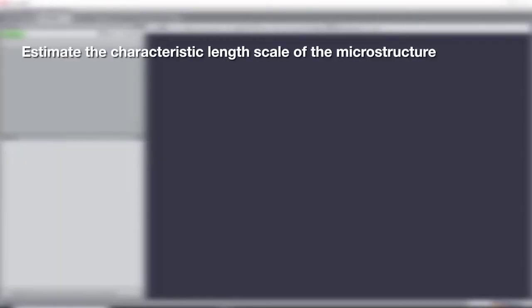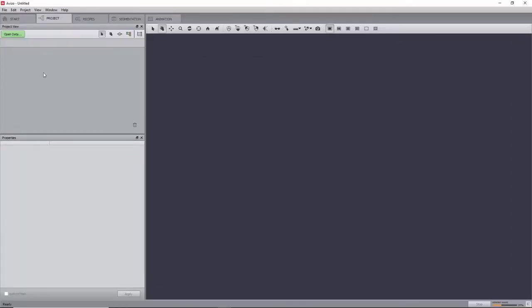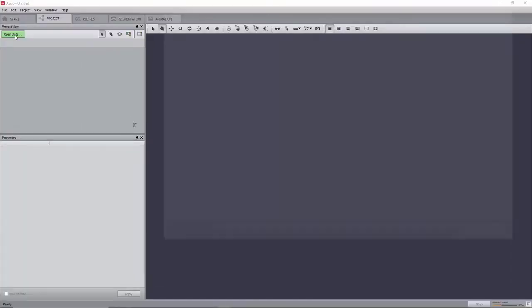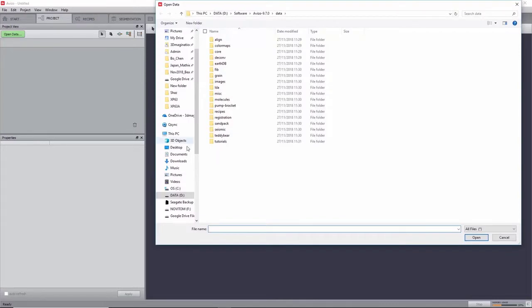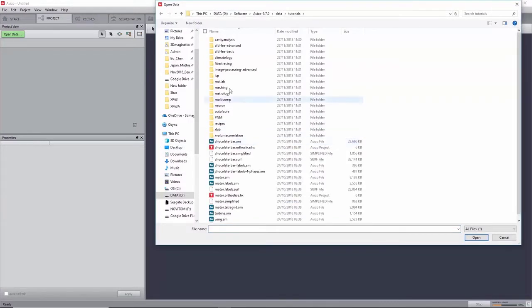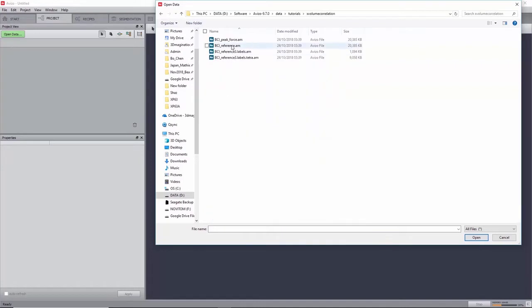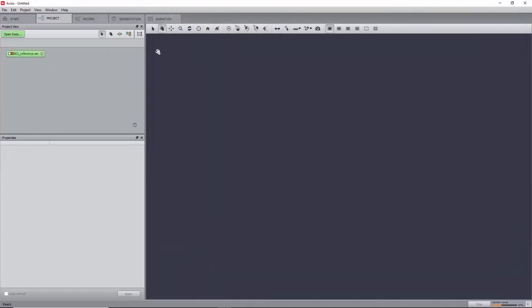The data in this tutorial is courtesy of the University of Portsmouth. We will start by loading bci-reference.am, which can be found in the folder Data, Tutorial, X-Volume Correlation, and we will refer to it as Reference.